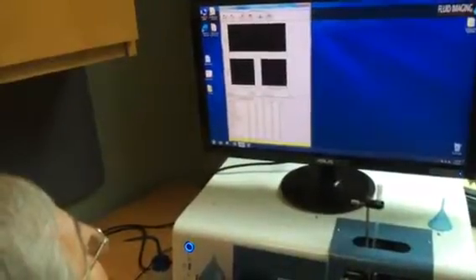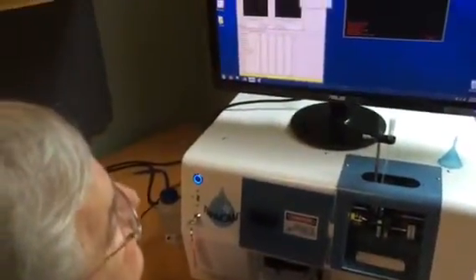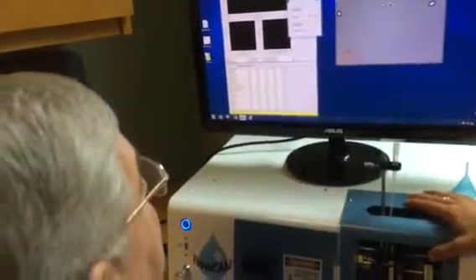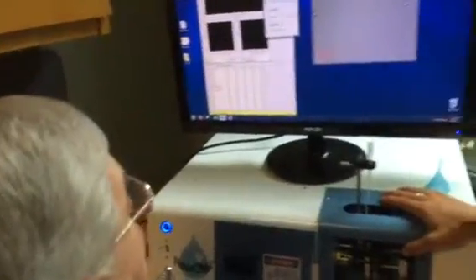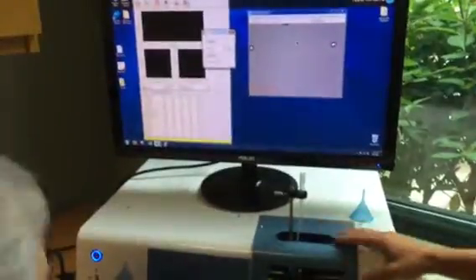Now let's go back to setup and focus. Our goal here is to manually prime our sample, so that it's sitting inside the flow cell, which we didn't do before, right? Exactly. So let's change the flow rate to 2 mils. We can do 1 or 2.